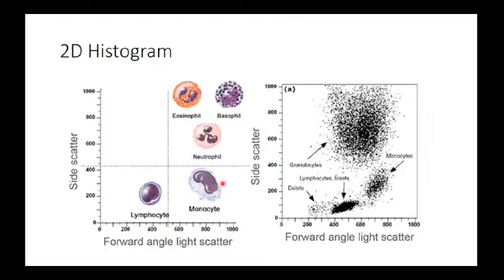And what's very special about this technique is that we can analyze many thousands of particles and cells per second. It's an easy technique. It's not very hard to perform, and it's precise. It's very used nowadays in all the laboratories.